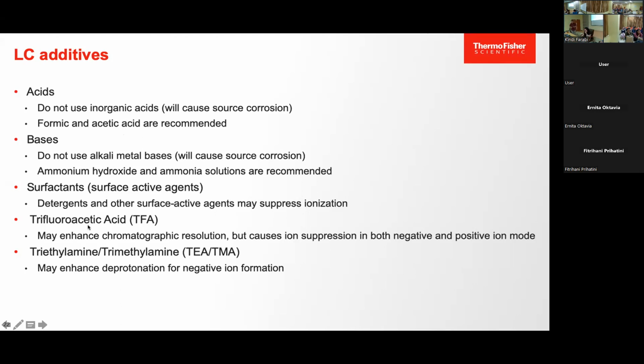TFA is no longer needed. You may still come across publications that use TFA. TFA is used to increase chromatographic resolution, but right now you no longer need it. It may enhance the resolution and the picture will be nicer, but it will cause ion suppression. What is ion suppression? You do one injection on the mass spec and the intensity is this high.